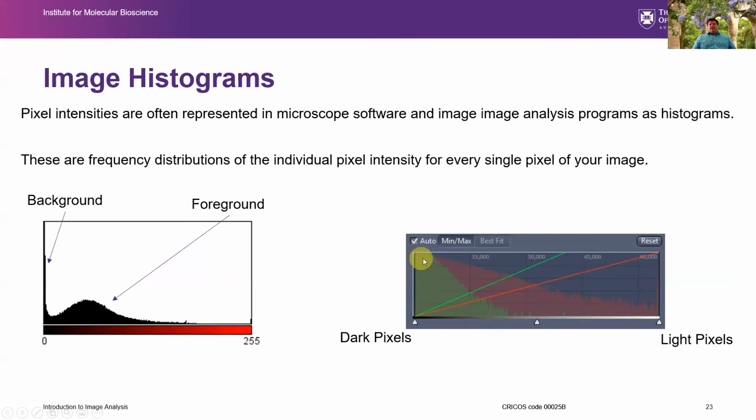It's almost like a linear gradient from having lots of dark pixels to some light pixels. But there wouldn't be a clear distinction like you can see in this histogram. So it's important when you're capturing to look at this data to think about the future and what steps down the track you might be looking at doing.